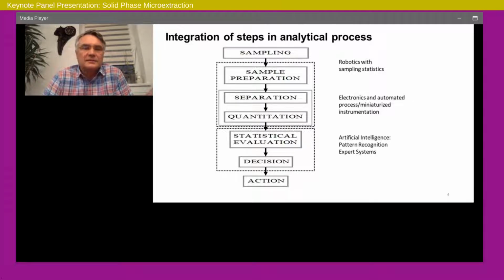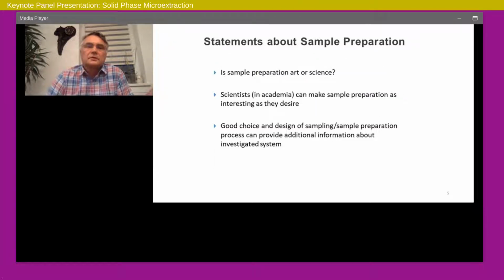So ideal sample preparation would facilitate high throughput or in vivo sampling. That's what SPME does. It requires a very effective coupling between the sample preparation and convenient introduction to the separation device, such as a chromatograph or directly a mass spectrometer.